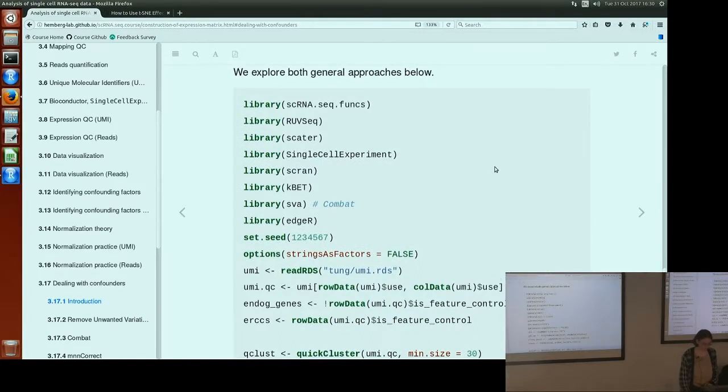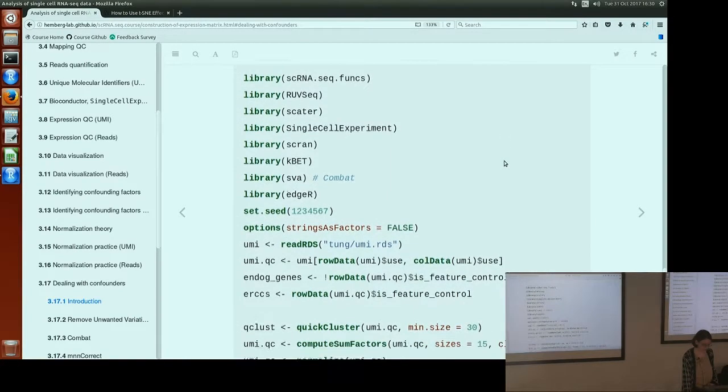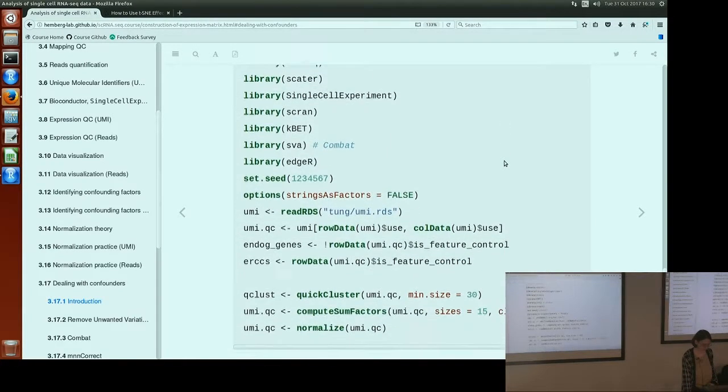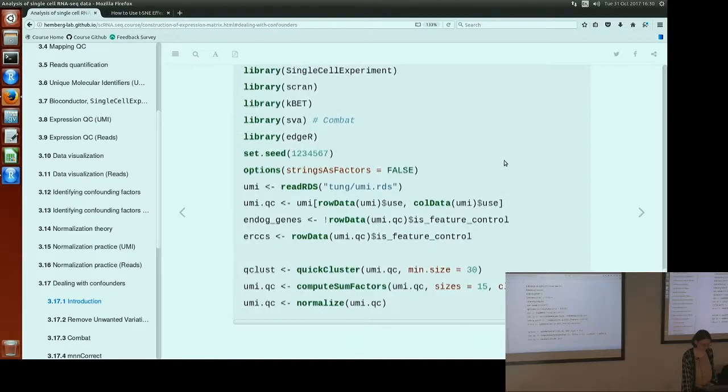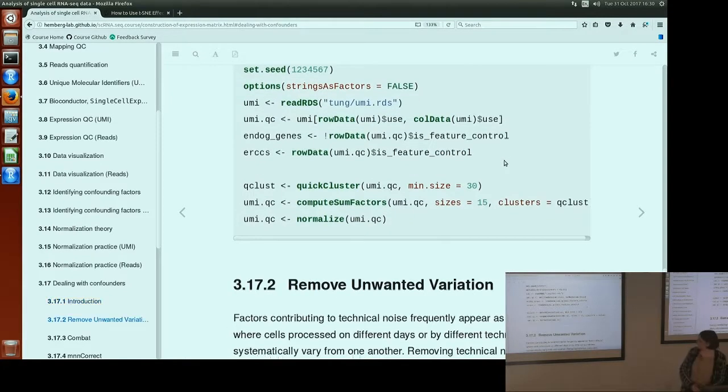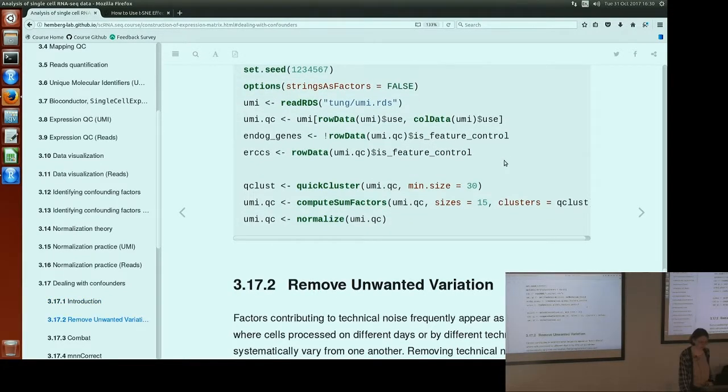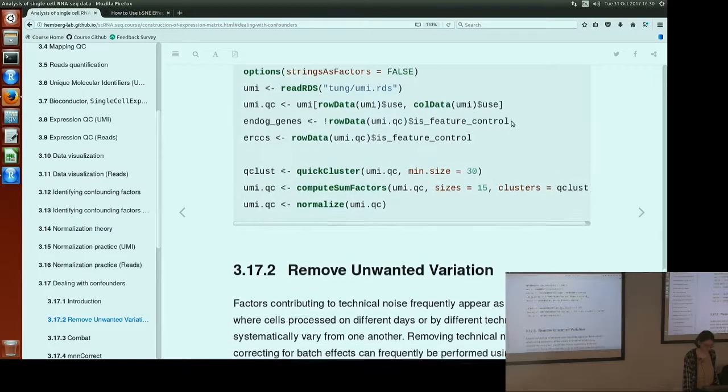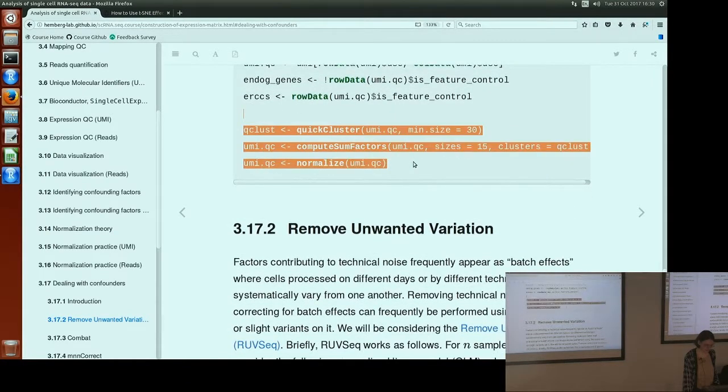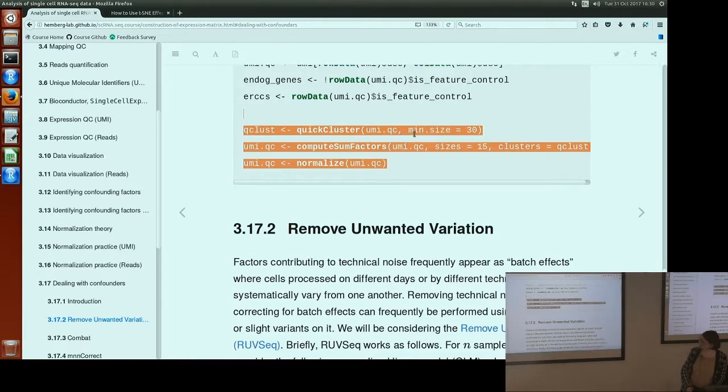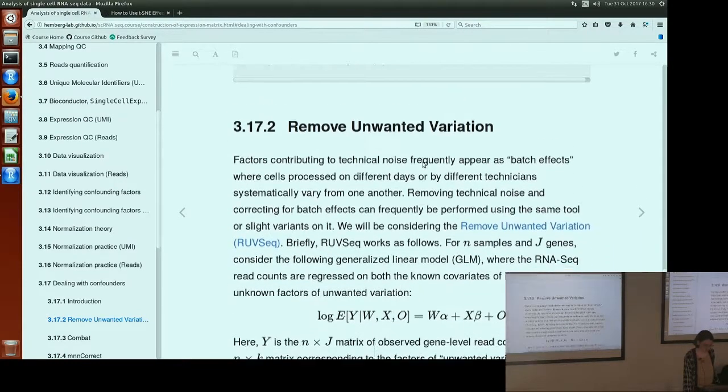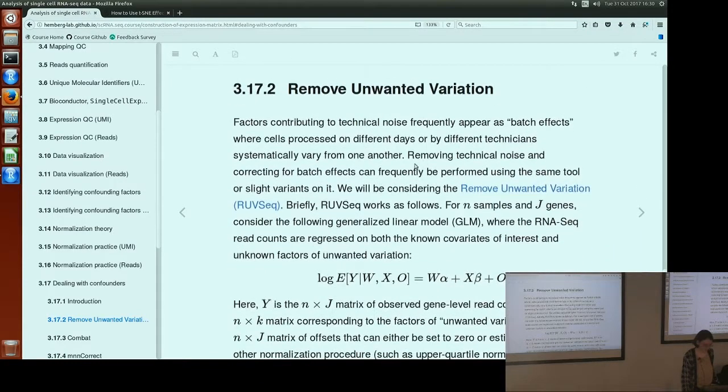These are all of the libraries we're going to be using in this section. And some code to load the data again, because we're going to be using Tung data. And if you haven't normalized this using scran, you should do so to make sure you have the right data.